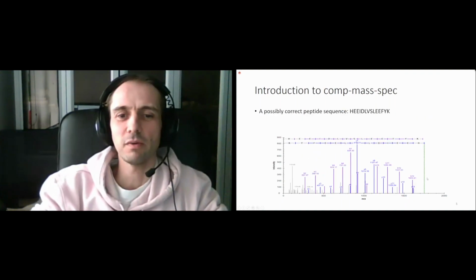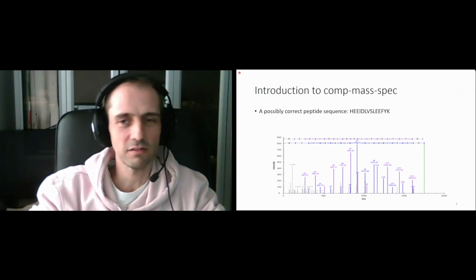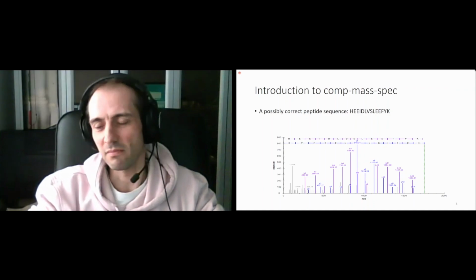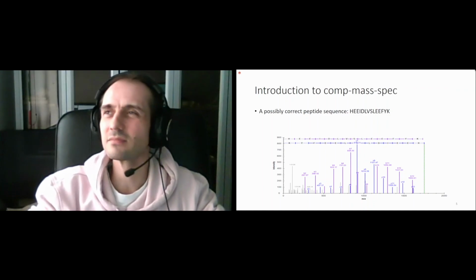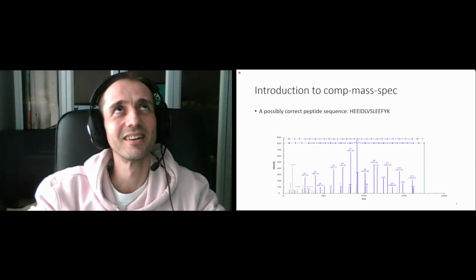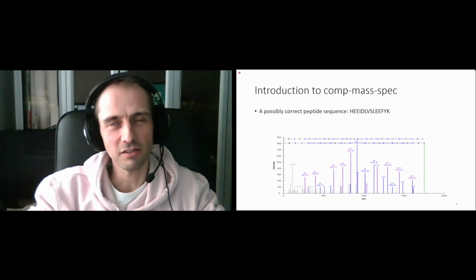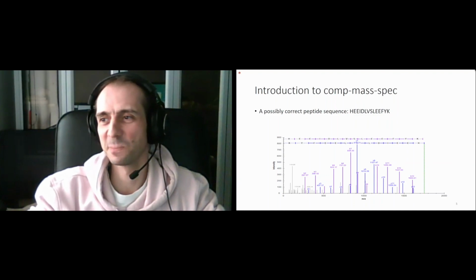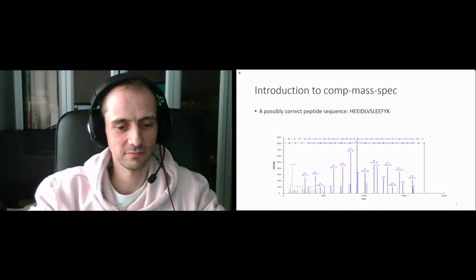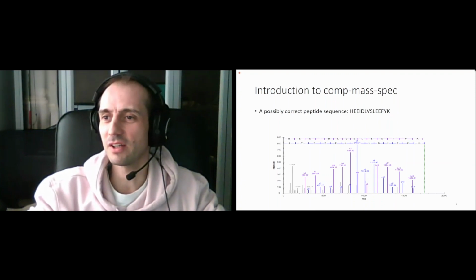Yeah, but there will always be some noise. There can be some contamination from the air, but the contamination is proportional to the magnitude of the spectrum. The more you put in, the higher the spectrum, or it's not true. It wouldn't ever be 100%. Yeah, of course, but you can say that within 1% error, you should have the spectrum. In 1% error, we can be very accurate.